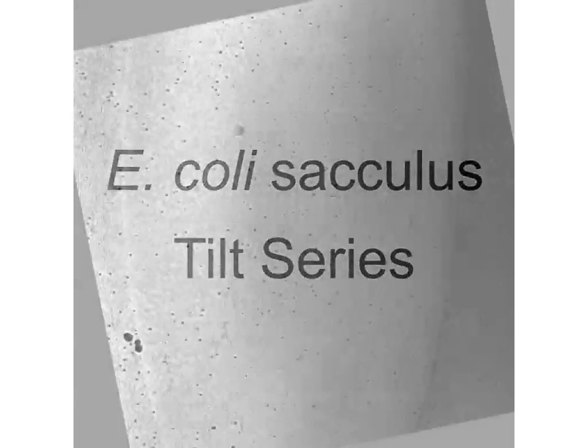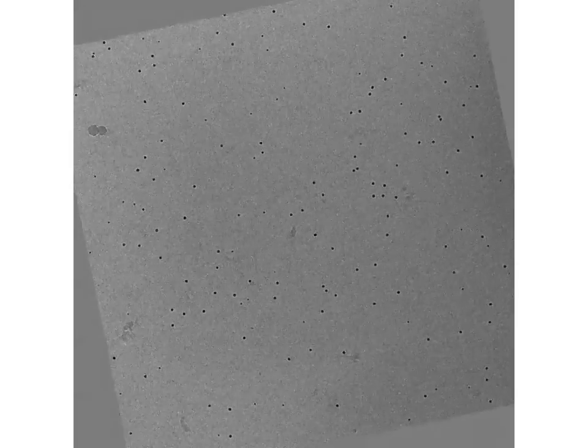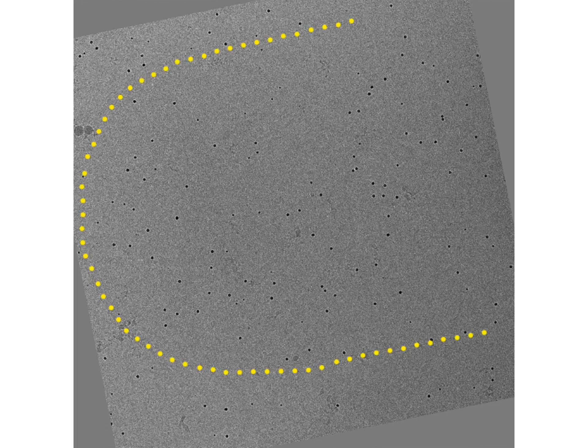This is an E. coli sacculus tilt series. In the zero tilt image, the sacculus is outlined by a yellow dotted line.